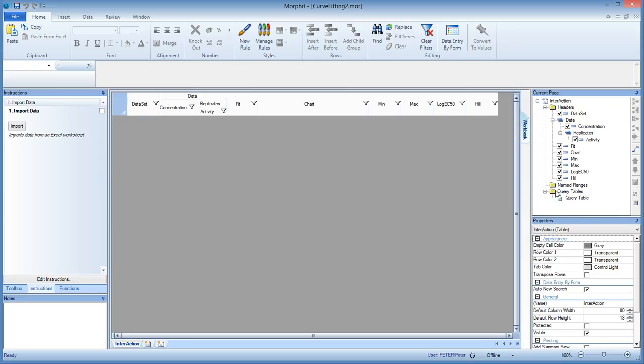So here is all the fields in the table and the query table was added in the second video and that was linked to this import button, import instruction, where we bring in the data from an external source. So the binder itself doesn't contain any data yet, it just contains all the formulas to do the curve fit.